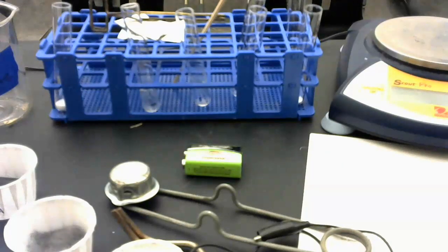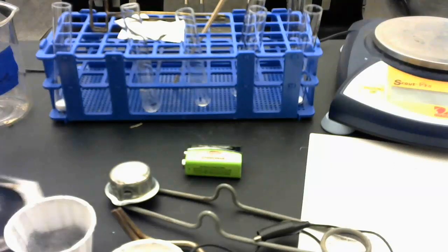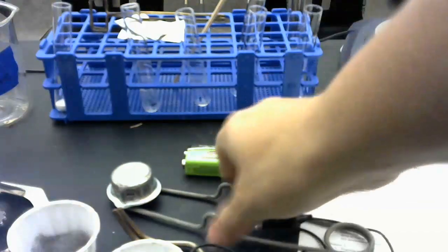Reaction type A says use crucible tongs, hold a strip of magnesium ribbon, and ignite it in the burner flame. So the first thing that we're going to do is light our Bunsen burner. I'm going to turn on my gas, and then I'm going to take my striker, okay?